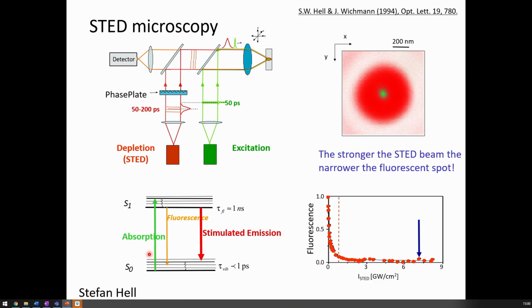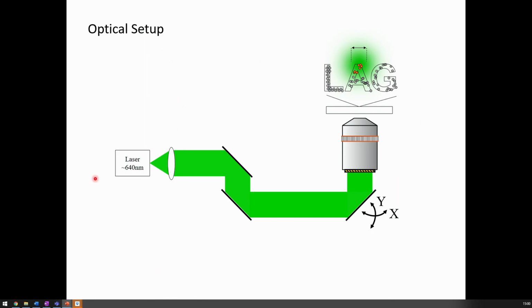So in practice, perhaps we have our normal confocal microscope. You have a mirror that here scans the laser beam across the sample. The laser beam goes through a collimator here, so you have a parallel beam coming out. You put it onto the objective, which acts as the condenser. The condenser focuses it onto the sample, and by tilting this mechanical mirror, which moves in X and Y very quickly, you can raster the beam across the sample. And then the fluorescence comes back. You take the fluorescence back, it goes through this beam splitter here and is detected.